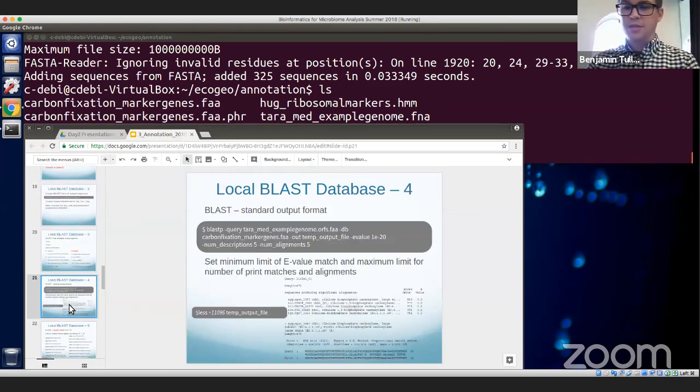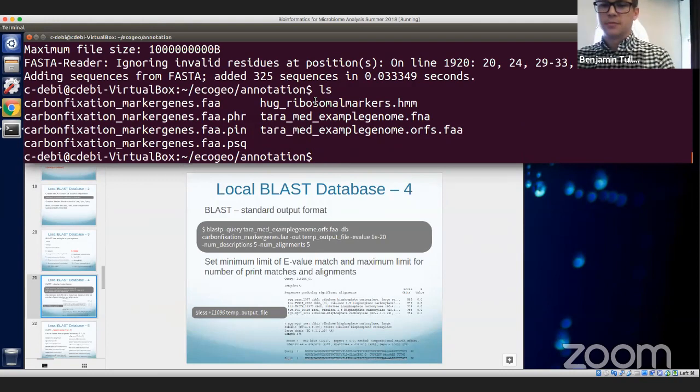So we can run this together. This is going to be the command that we run. We're going to run blastp because these are two protein databases. We're taking our protein queries against a protein database. There are lots of other options for BLAST. You can do nucleotide versus nucleotide, and then other versions of translated nucleotides versus proteins in multiple different avenues, depending on which is which in your database versus your query.